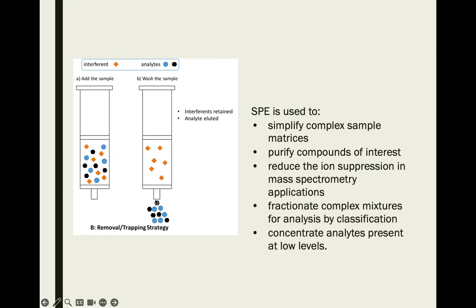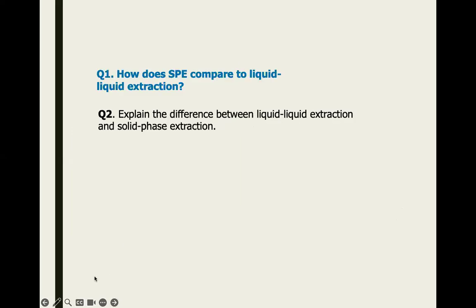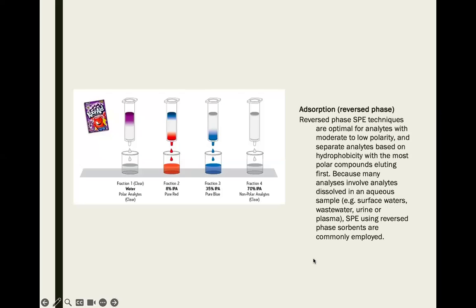If you have a very low concentration, you can flush it out, gather it, and pre-concentrate it, rather than running the analysis directly from the raw sample that you prepared before. This is again the same usage, but in a different style. You can see that it really helps if you want to separate just a tiny bit. You don't have to use a lot of solvent because the cartridge can be designed to be very small.